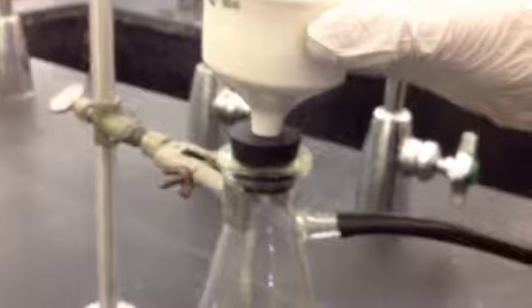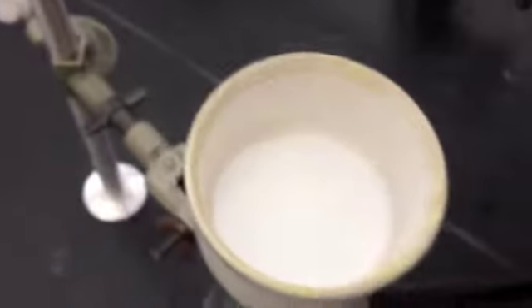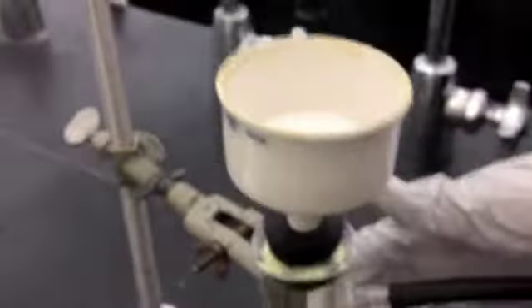So let's talk a little bit about vacuum filtration. So this is called a Buchner funnel. Inside it we have a number 4 filter paper. The number 4 filter paper has very small pores, so your product does not fall through into the flask here. So here's the number 4 filter paper. It's actually too big for this Buchner funnel, so we cut it with scissors.